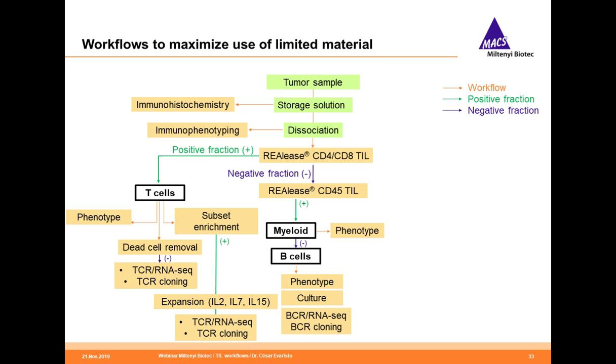Finally, in the positive fraction from the tumor cell enrichment step, other cells of interest can be recovered, such as cancer-associated fibroblasts, which can be phenotyped.